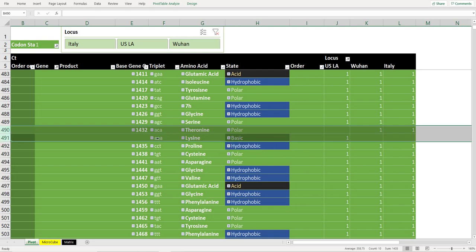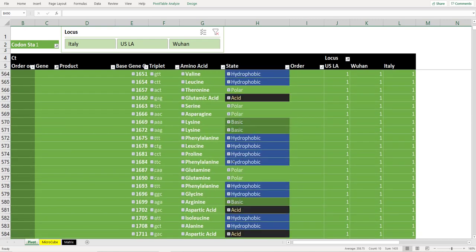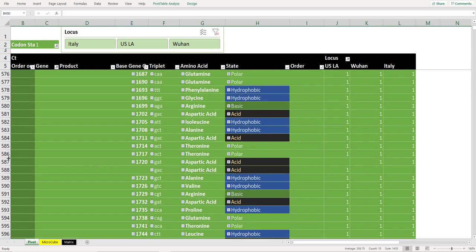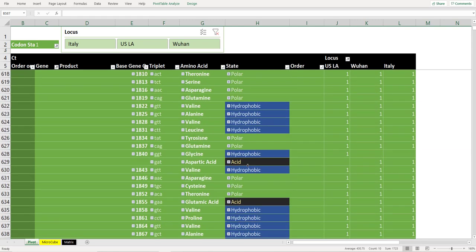Okay, we have the loss of a cytosine turning into an adenine there, which is interesting because those two don't usually bond, so that's an interesting change in mutation there. And we got something down here, which is some aspartic acid slightly changing from a thymine to a cytosine, it looks, at the end of that one.